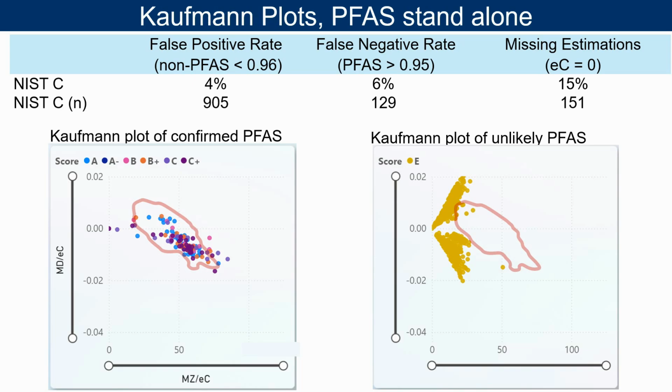Here's one more plot. And so the data that we're plotting and that we plotted before is for AFFF, or firefighting foam contaminated soil. Again, National Institute for Standards and Technology distributed this sample to many labs to see the state of the art for PFAS, how we were doing. Now, it's very cool to see what this algorithm does. So in red is the expected region for PFAS based on the EPA database. Remember, we created this expected region.